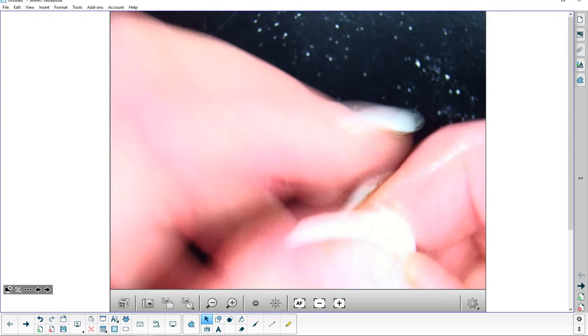Okay, you're going to have this, and you'll have a lid, and you'll have an effervescent tablet given to you, and the effervescent tablet will be like this. Remember that you want to do at least 3 trials, 4 is better or 5 is even better. So I would try and just take this very carefully and break it in half, and then break it in half again, so that you can do 4 trials. About a fourth will give you, this will be the excess.